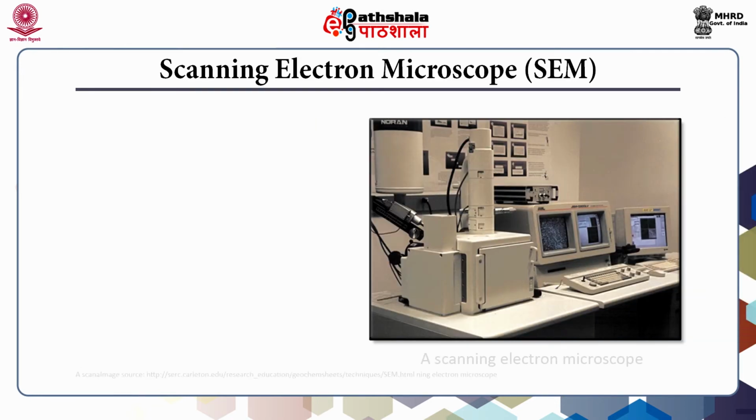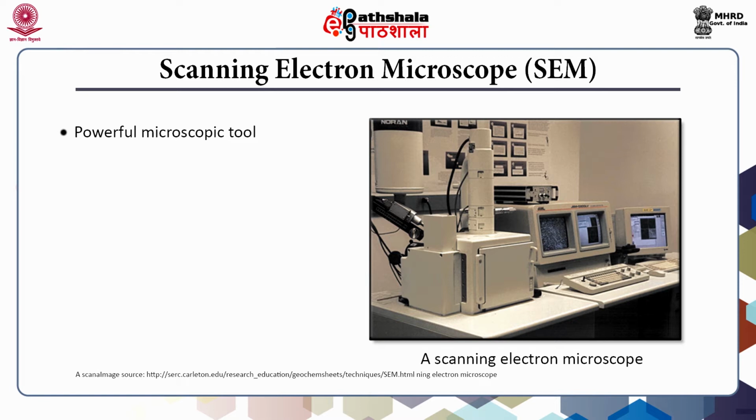A typical image of the scanning electron microscope is shown at the right side of the slide. The scanning electron microscope is a powerful microscopic tool that utilizes electrons to form a magnified image of a specimen under study.